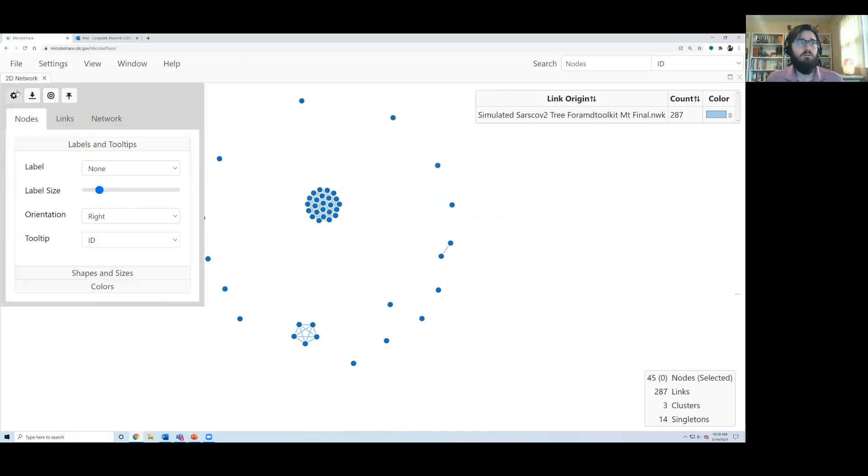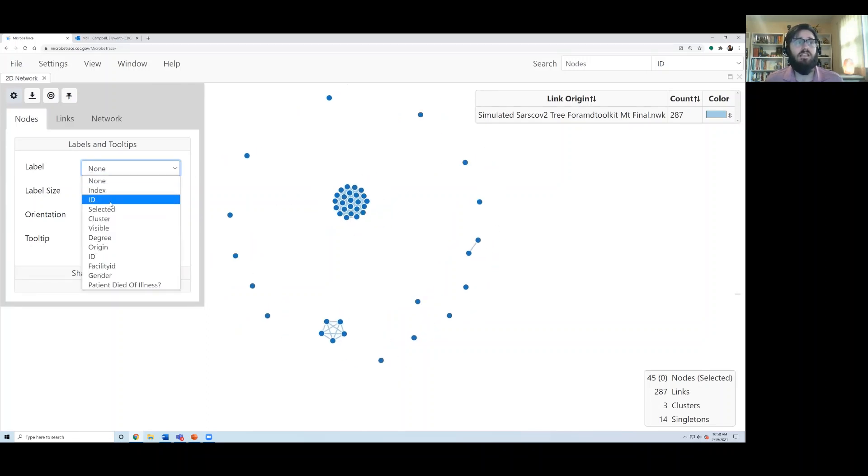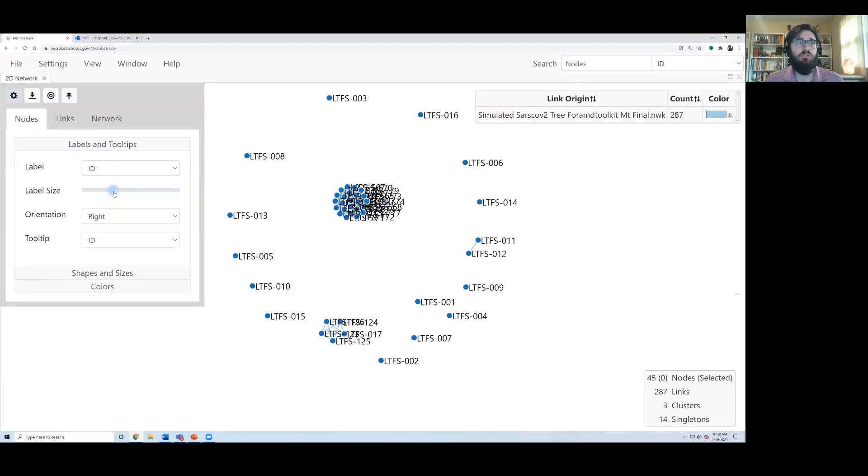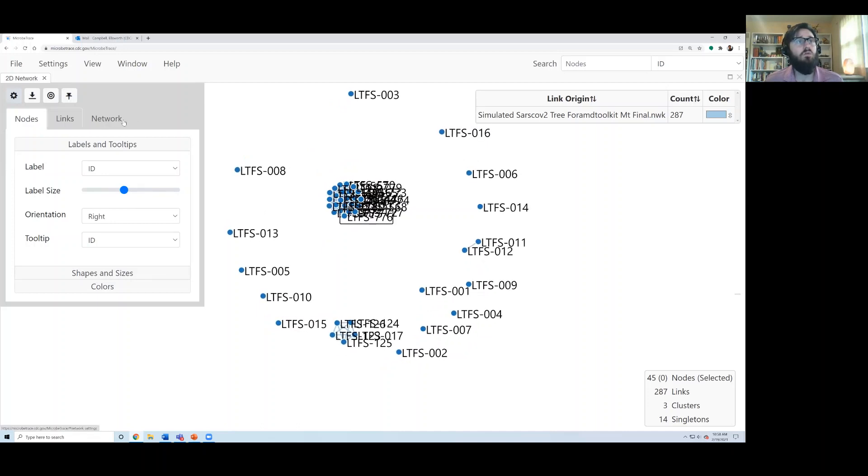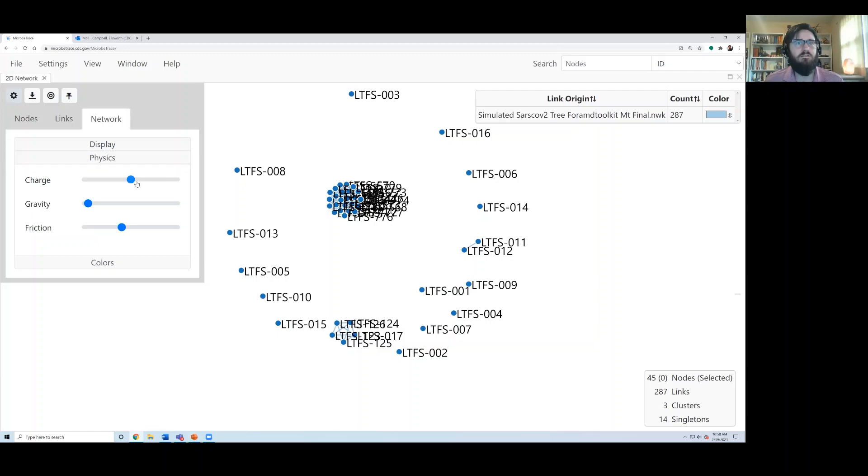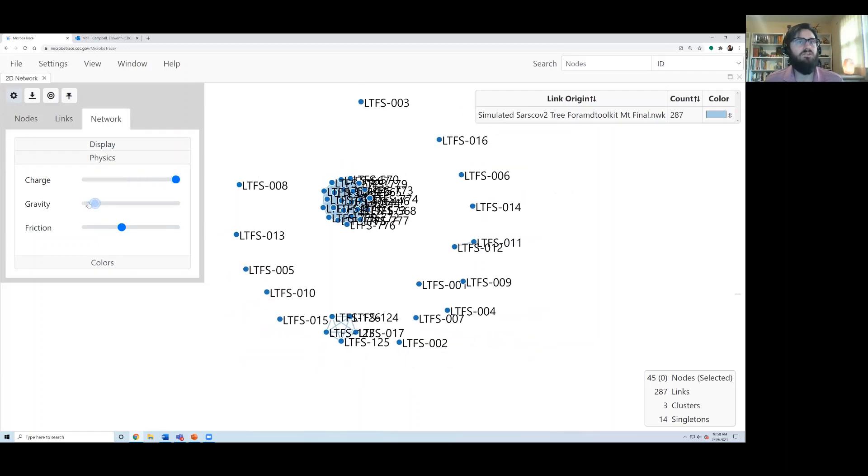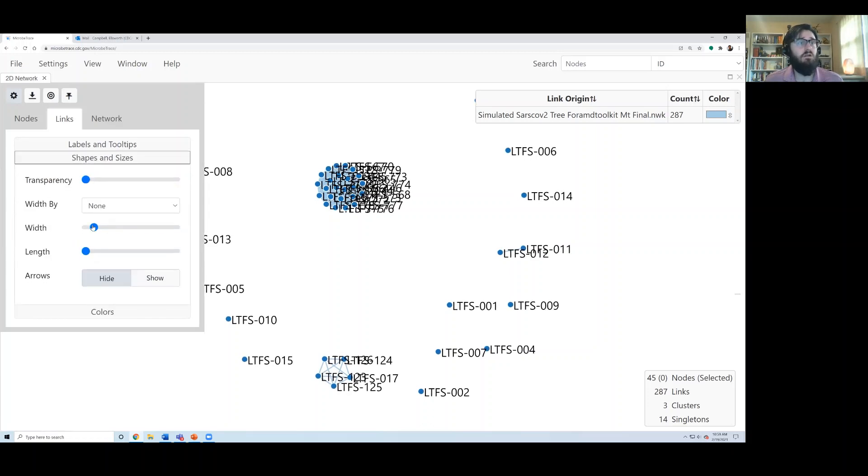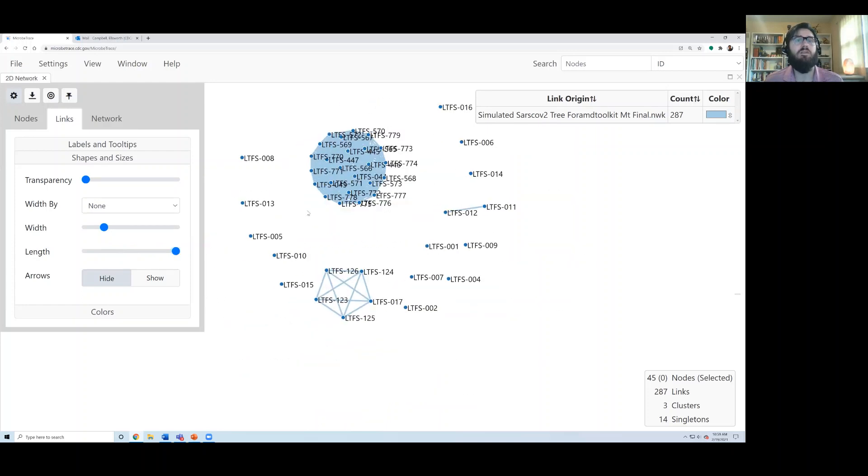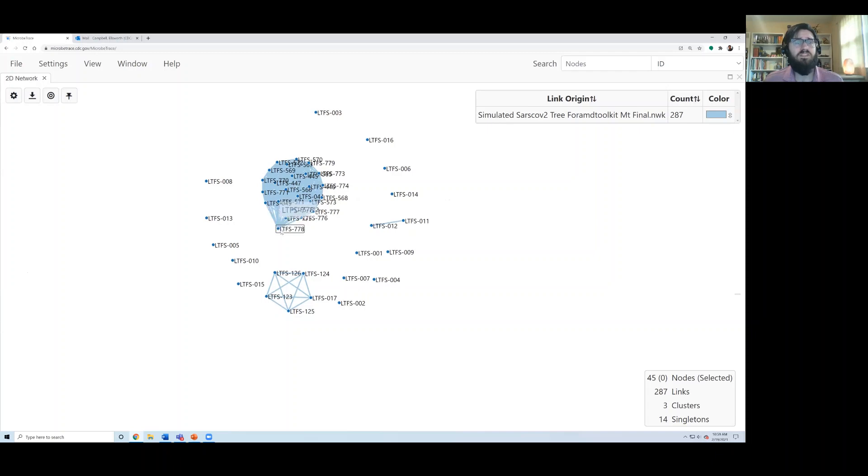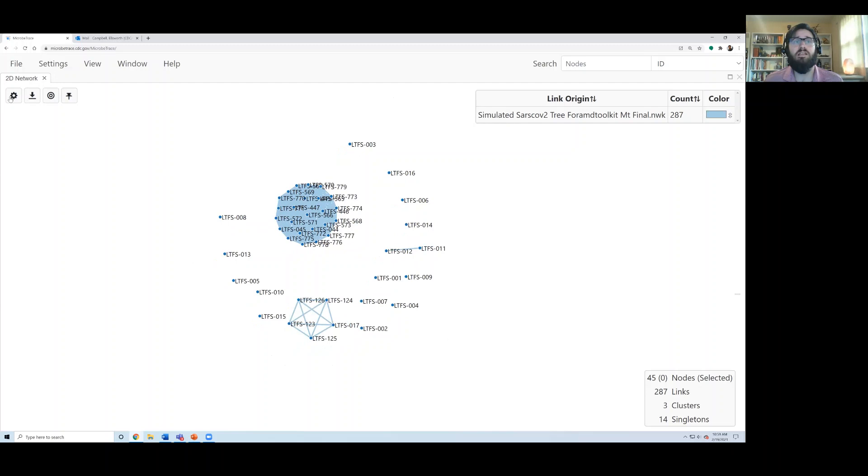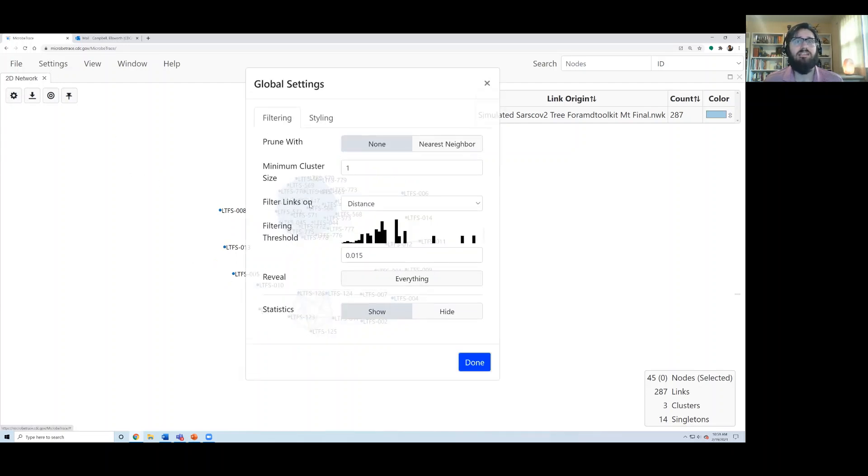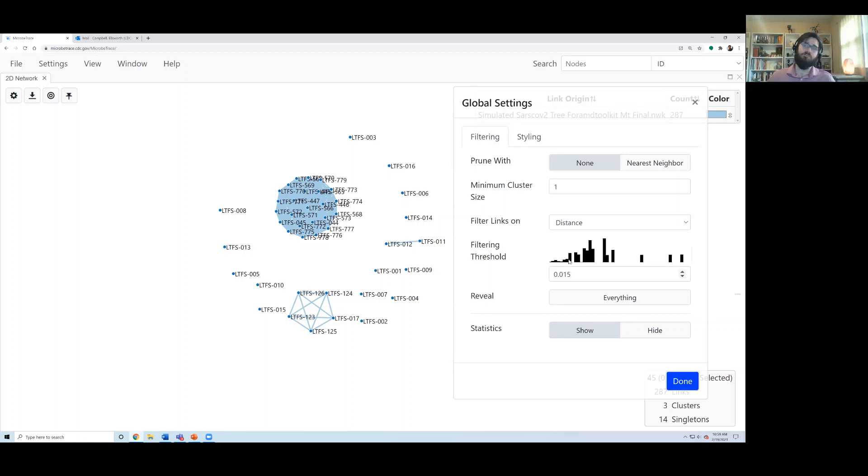But the real meat of the tool is this gear here, where we can visualize data associated with the network. So we can, say, add a label to these individuals. Notice they're very much overlapping here. You can't read it. We can go over to this network tab, access the physics settings, and start to spread the network out and change some of these characteristics. We can increase the length of these lines to get an idea of how many people are here. But this is a very deeply connected cluster where almost everyone is connected to everyone. And we want to fragment that.